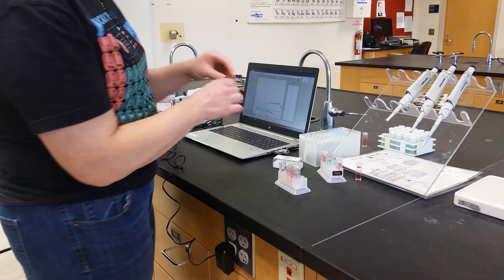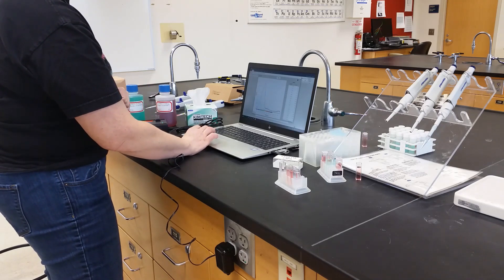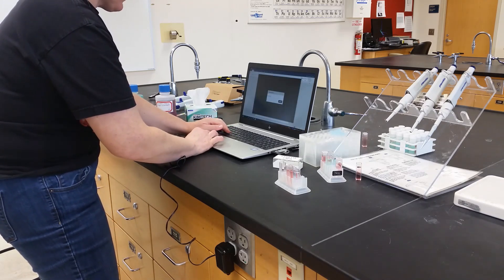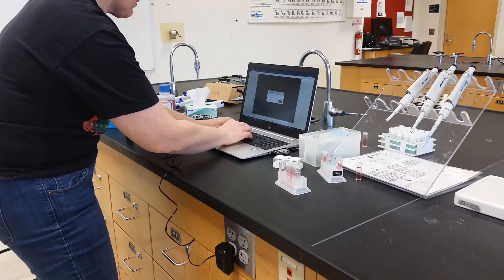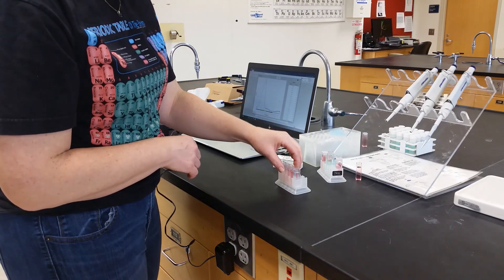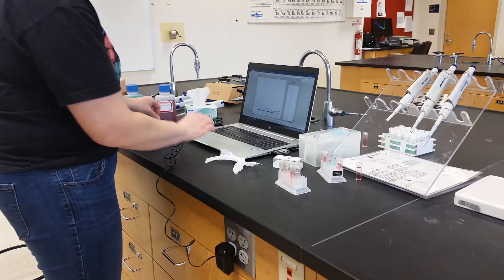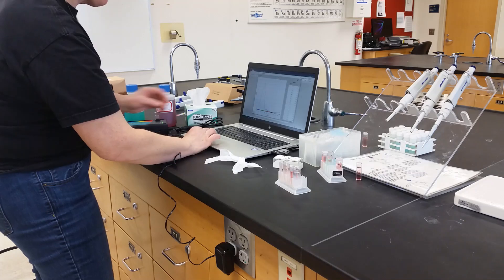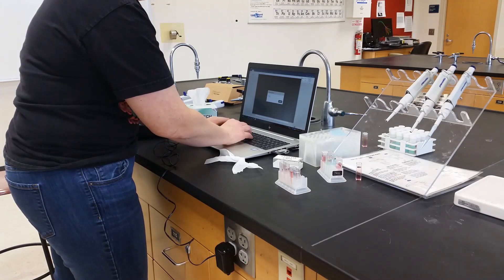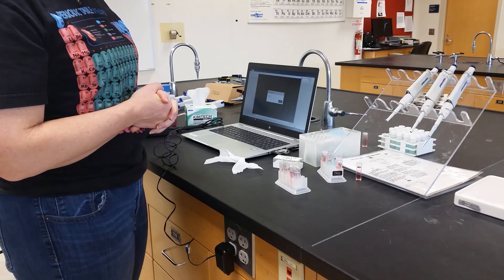We go to standard two, add that to our spectrophotometer, hit collect, stop, and rename our data set as standard two. We continue on collecting data for all four standards and also our unknown sample. We can then use that information in order to do the calculations and figure out what the diluted concentration is of our unknown.